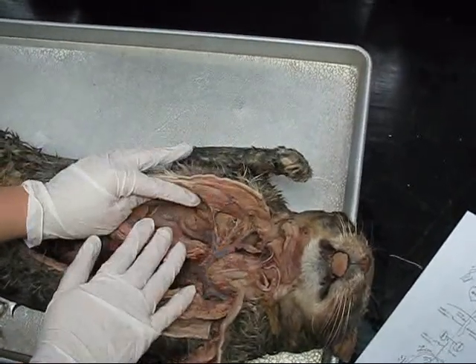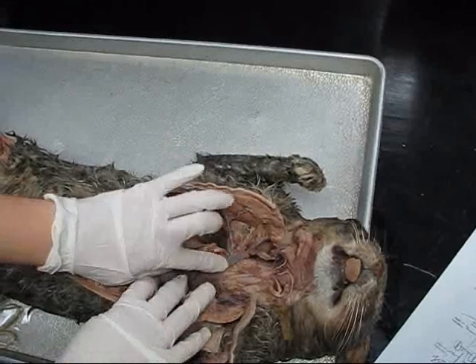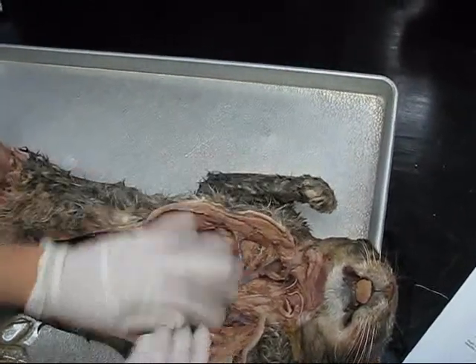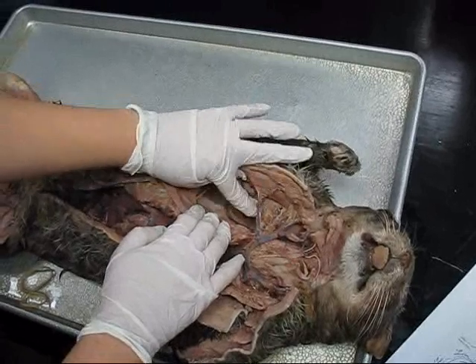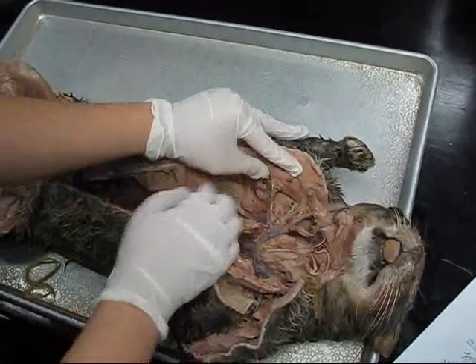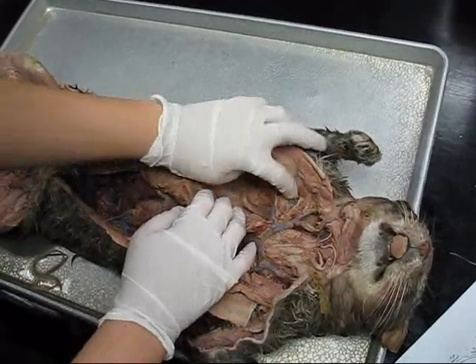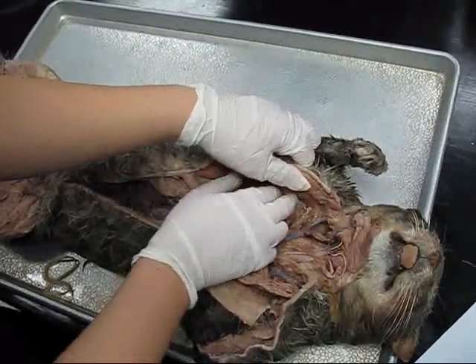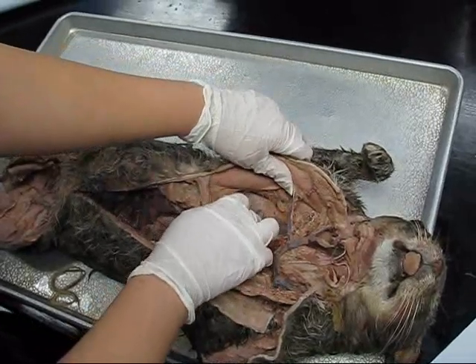As far as the ones going to the arm, it's best to just memorize the order. The subclavian would be where it first comes off — where the brachiocephalic ends, going off toward the bottom, would be the subclavian. Then kind of closer in where the armpit would be would be the axillary, because axillary is always associated with the armpit. And the one going most lateral, continuing on toward the arm, is the brachial.